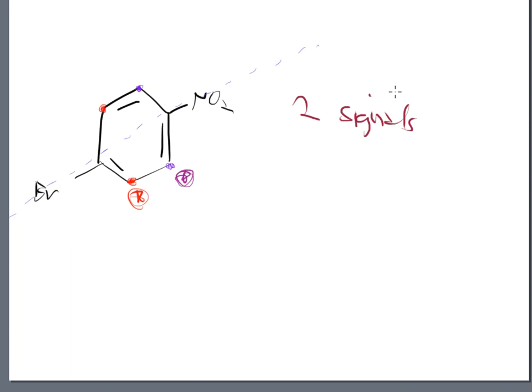Unlike A and B, which all had the same nitrogens, the same number of oxygens, the same number of carbons, the same number of hydrogens. They're all still a ring. It's just how those 2 groups were positioned to each other. We had an ortho, we had a meta, and we had a para attachment on these benzene rings. So here for C, the para position will give me 2 signals, unlike A and B, which gave me 4. And then each one of these, just to follow through, each one of these will have a hydrogen on it, right? We know that they're there. I'm going to draw them, and we're going to see what begins to happen here.